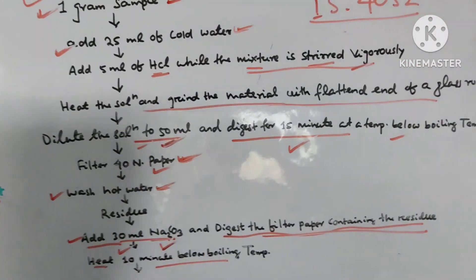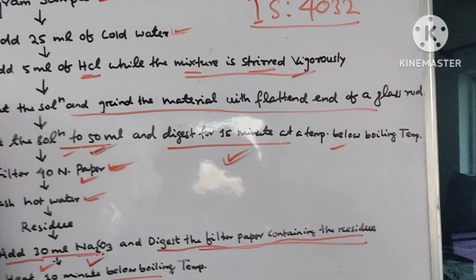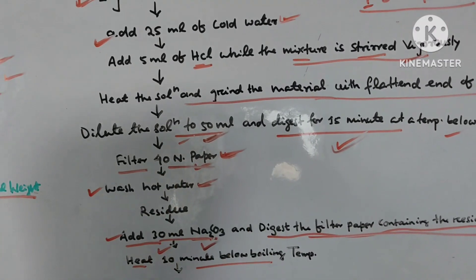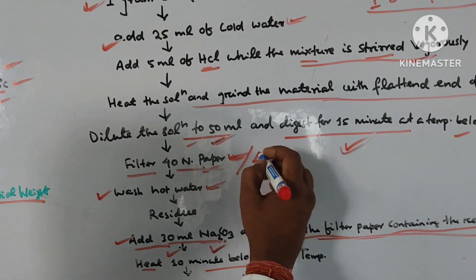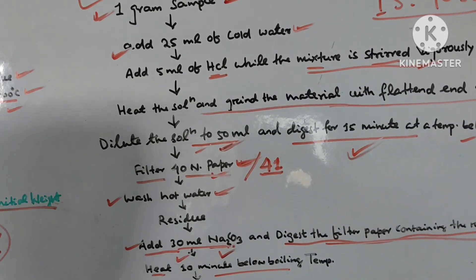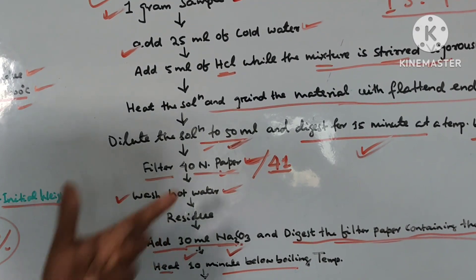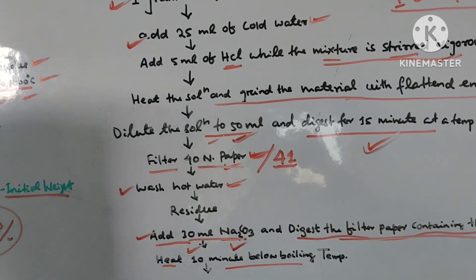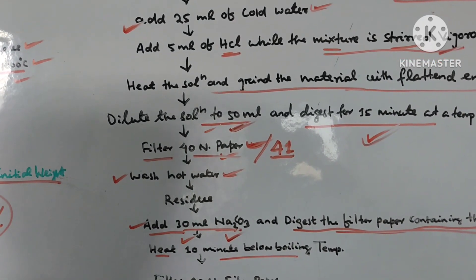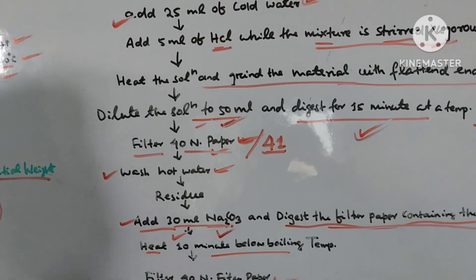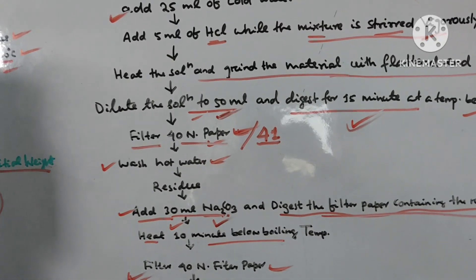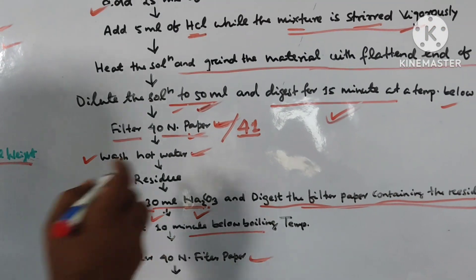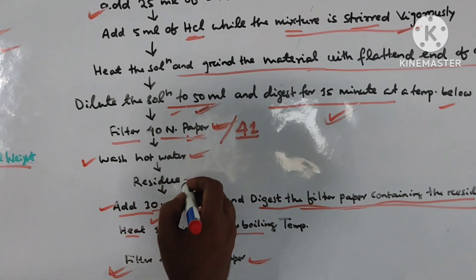Dilute the solution to 50 ml and digest for 15 minutes at below boiling temperature. Then filter the solution using No. 14 filter paper. If No. 14 filter paper is not available, you can use No. 41 filter paper. During washing, when you wash the sides of the filter paper, use hot water - this is very important when you do any type of filtration.